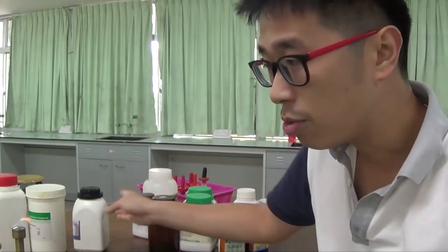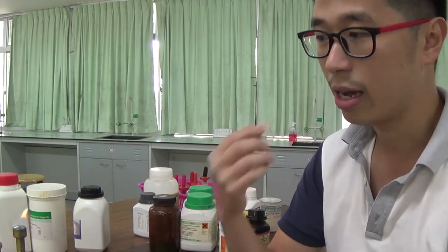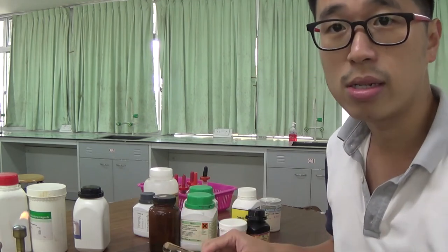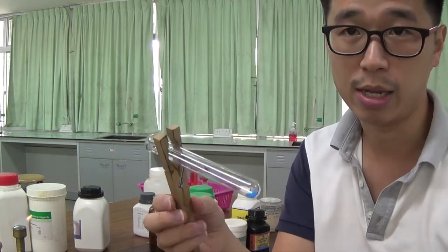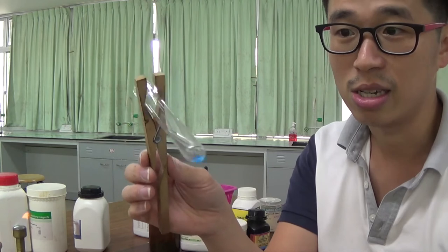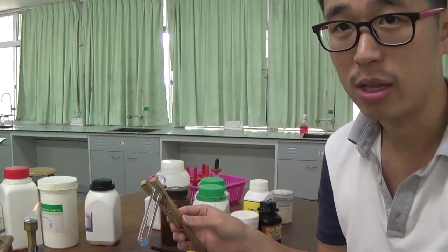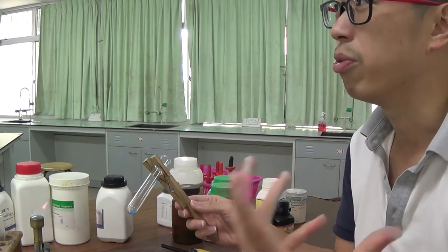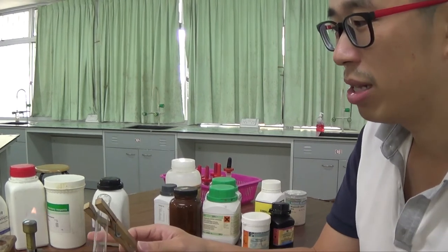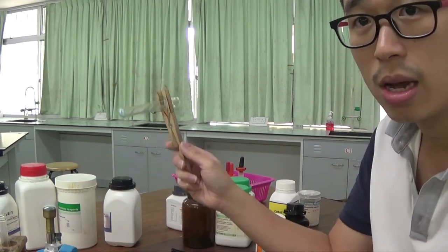Okay. In qualitative analysis, they like to ask you to work out the identity of the cations. In A levels, they like to ask you the case study of copper 2 plus and cobalt 2 plus among many other transition metals. But here I'm just showing you the water of crystallization will come off first when you do thermal decomposition. If it does decompose, the water of crystallization always comes off first, alright? Because water boils at 100 degrees Celsius, and a Bunsen burner, 100 degrees Celsius, is very easy to reach when you have the blue flame. So let's start heating.